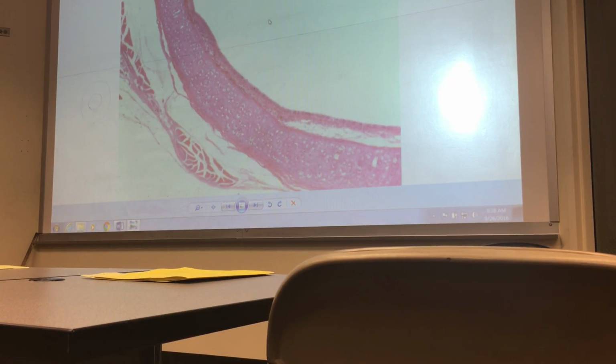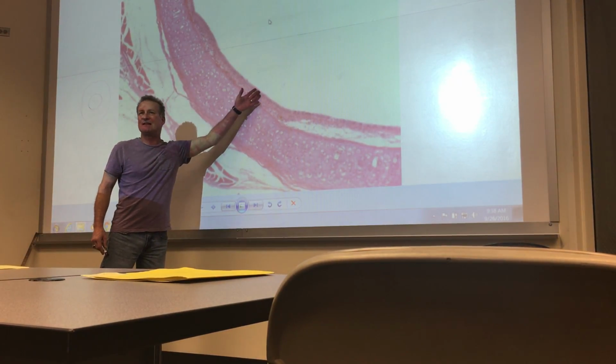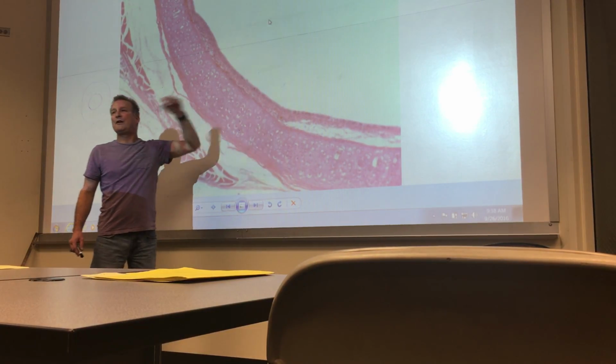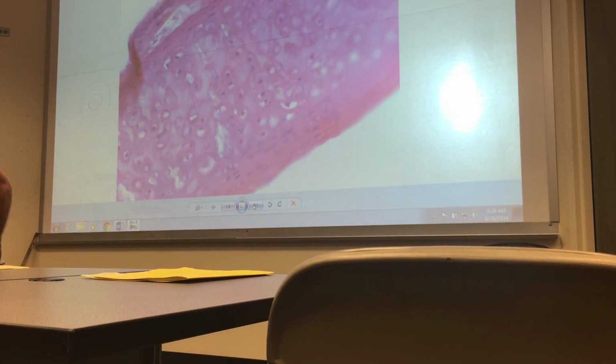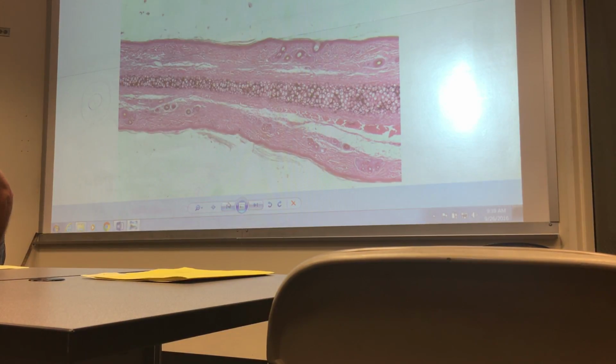And if you need me to increase the magnification, because everybody knows it's the trachea, and you're wanting to ask about, say, the 3 types of cells found in PSCCE, maybe you want more magnification. So you might say, I like what I picked, but could you increase the magnification and zoom in on the lining? And I'll say, yeah, we can do that. Make sure I'm doing what you want. That's not it if I understood you correctly.